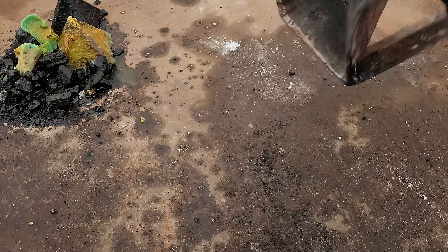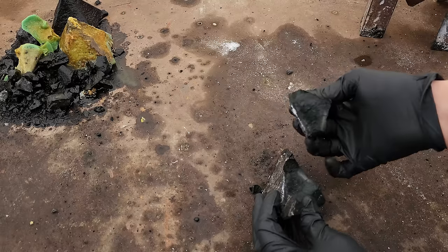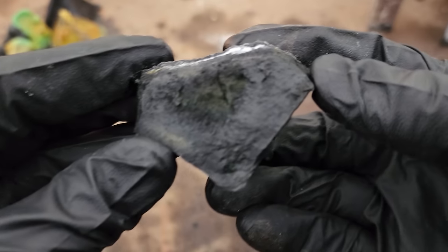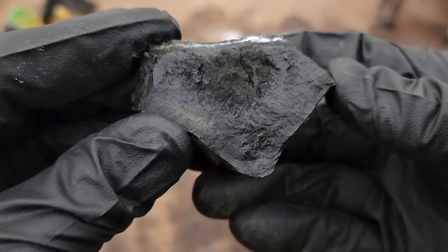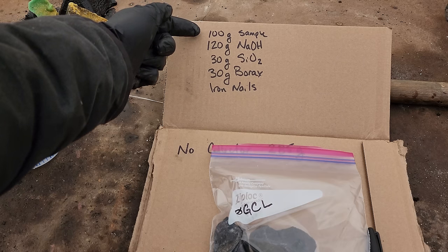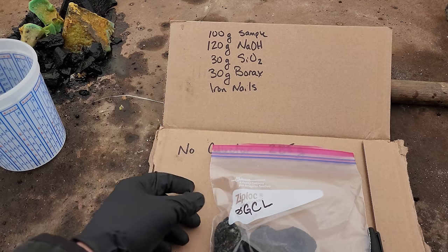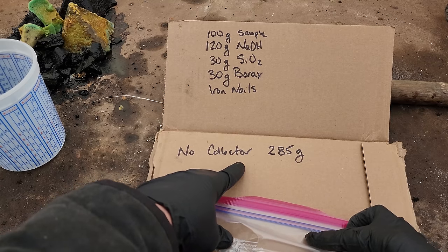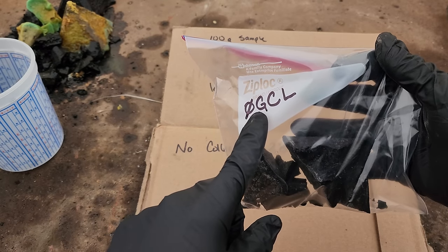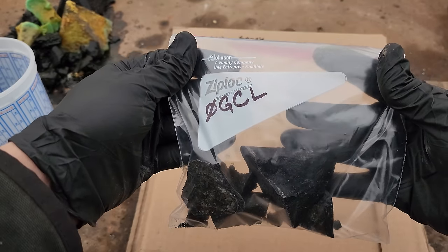I've edited the formula a little bit. I did 120 grams of lye, 30 grams of silica, and 30 grams of borax. I took out all of the oxidizer because it tended to boil over. So here's going to be our final recipe: 100 grams of sulfide sample, 120 grams of lye, 30 grams of silica sand, 30 grams of borax, and iron nails. I'm going to weigh each of the slags. Our first one — no collector metal slag — weighs 285 grams. That's 0 grams of collector metal with the lye as our flux. There's our first sample.